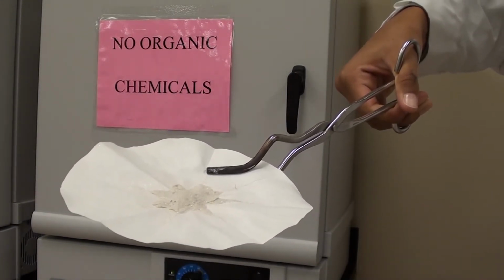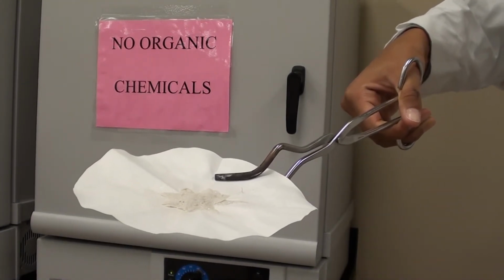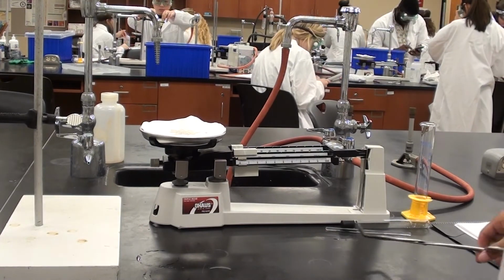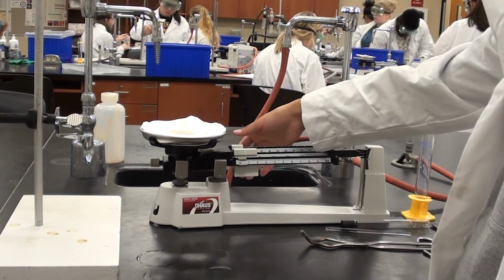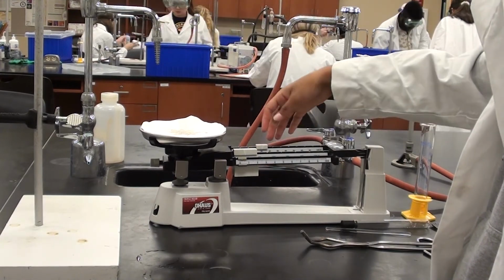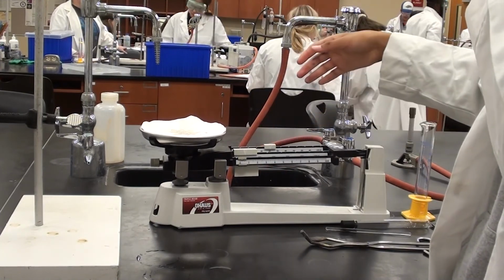You can always tell the difference between wet sand and dry sand. Now she's going to take this over and put it on her balance. And Sabrine will put this directly onto the balance, and she will get her mass. Now, that's not just a filter paper. It's hard to see it, but underneath that is still the watch glass as well. So she's weighing the watch glass, the filter paper, and the dry sand. Now please keep in mind there's no need to weigh it while the sand is wet. It's pointless. All we're interested in is the mass of the dry sand.